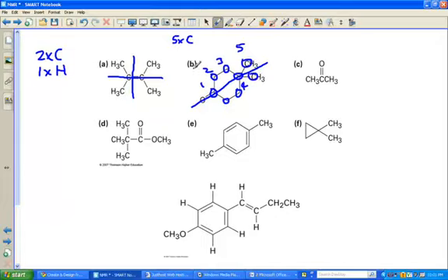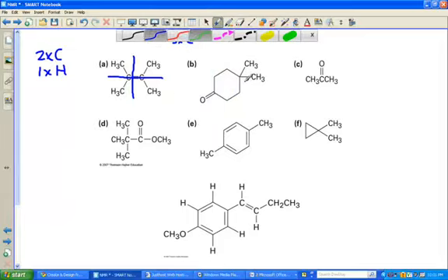And when we look at our hydrogens, we'll just get rid of this stuff. When we look at our hydrogens, we've got the two methyl groups. We already said those are the same, so that's one type of hydrogen. These two CH2s are the same. These two CH2s are the same, but they're different to each other. So these guys, we'll call this type 2 if this is type 1. These are different to type 3, simply because what they're attached to on the outskirts of the ring here is different. Carbonyl group, 2 methyls. Alright, let's speed up for the others.